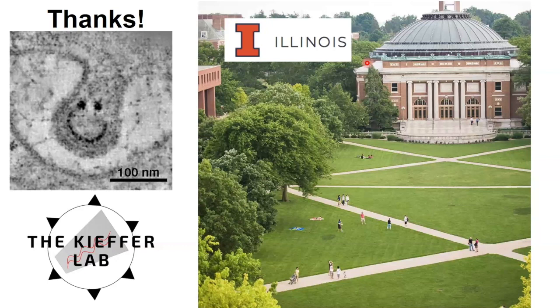So practically speaking, what we normally do is prep a lot of samples at once, because it might take 2 weeks to actually stain everything. There are also things we can do using DARPins or camelid antibodies, immune targets that are much smaller than an antibody. That's one way you could potentially get around that, but so far we've just used time to get in there.